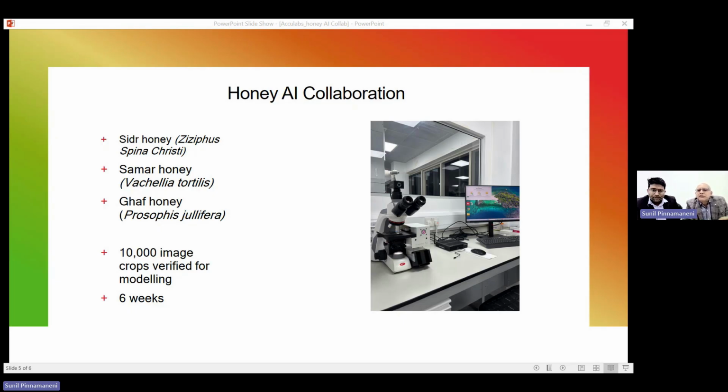And with the analysis, the process I did was, we went first the traditional way with manual microscopy. Traditionally, we used a staining technique, and we had those images for comparison. For each species, there are around 3,000 images in total.